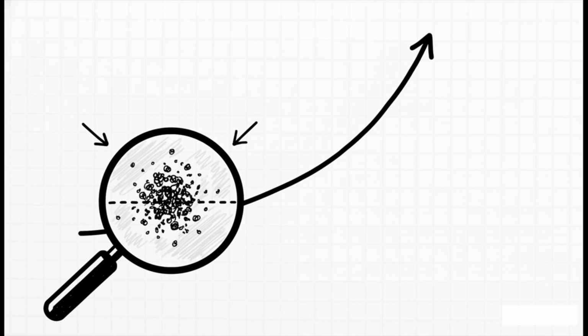Step 5. Recheck your calibration and sample classification logic. As bench scientists, we often focus so purely on the biochemistry that we become totally blind to the reporting logic. Your standard curve can fit beautifully, looking totally flawless, while low-level false positives are completely ruining your sample classification right near the reporting cutoff. Always check how your biochemical modifications actually affect the clinical or study decision thresholds.